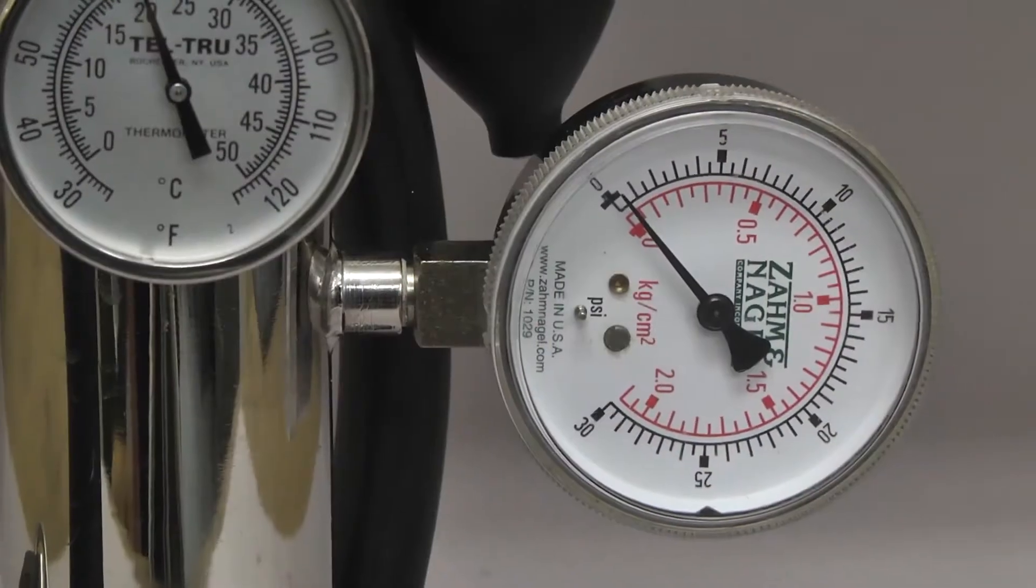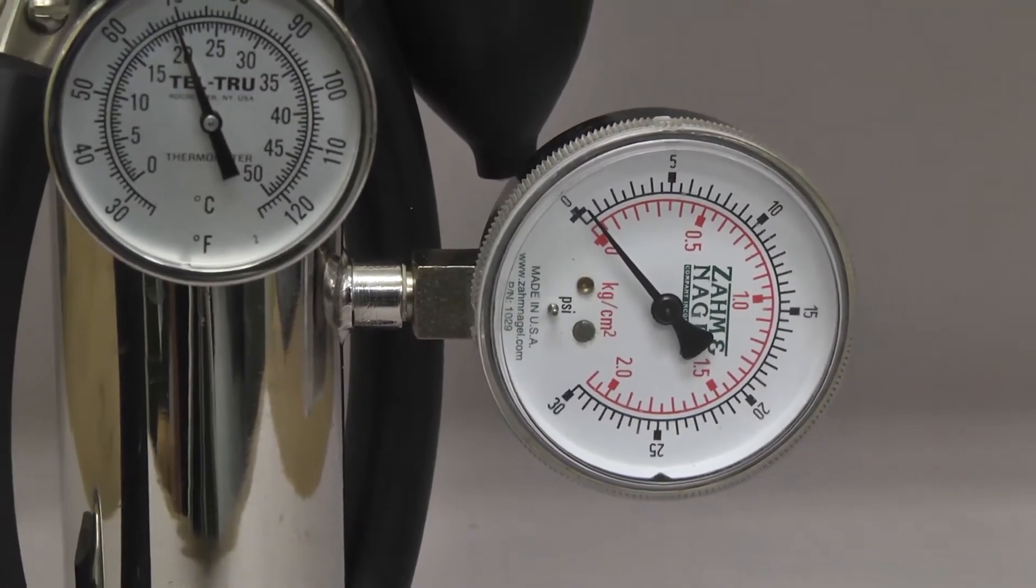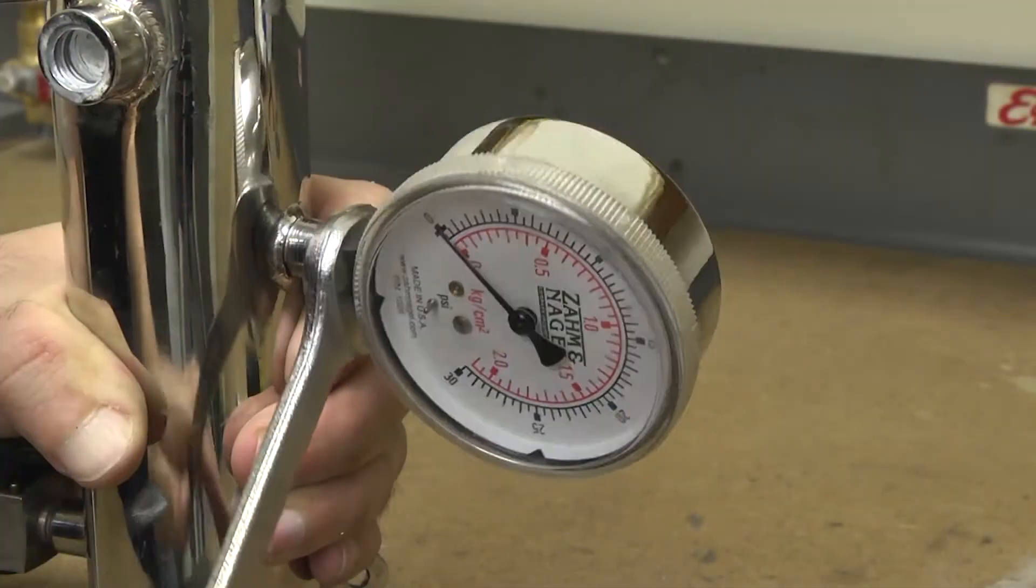To test and calibrate, remove the gauge from the instrument by unscrewing counterclockwise.